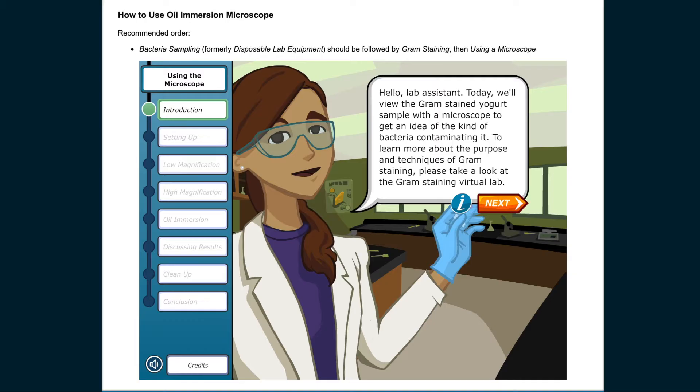Hello, lab assistant. Today, we'll view the gram-stained yogurt sample with a microscope to get an idea of the kind of bacteria contaminating it.